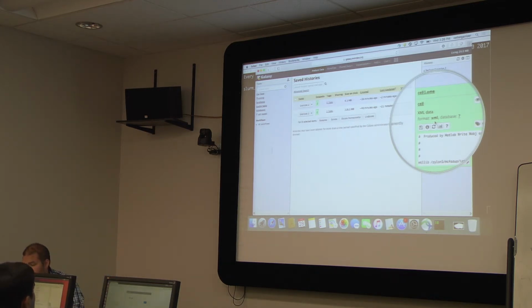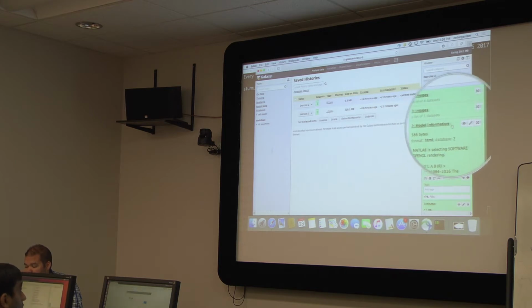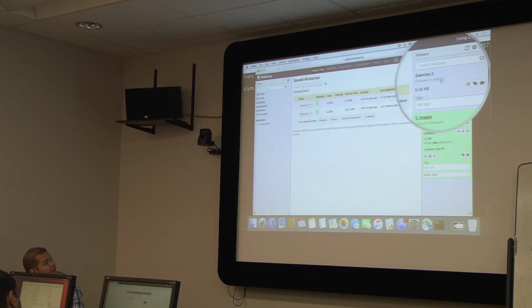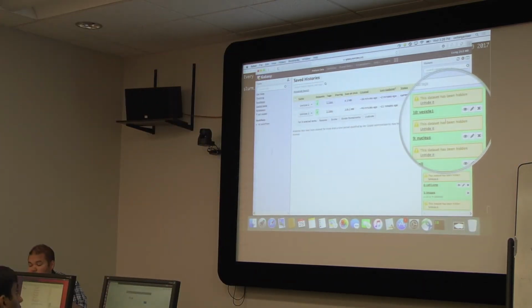So let's do a couple of things. I'm going to go back to the history, and I'm going to select, you see where it says 6 things are hidden? Okay, so I'm going to click that, and now I'm going to see these hidden things that were shown in my history.